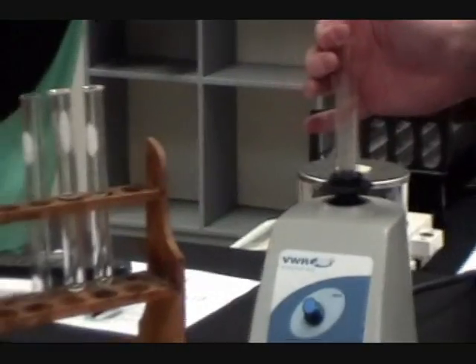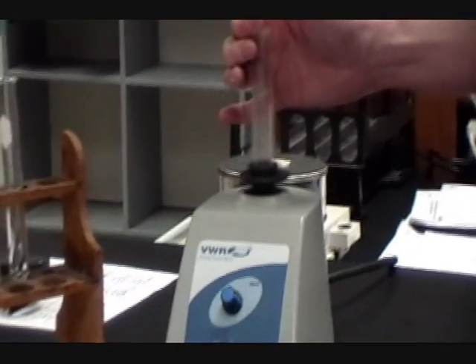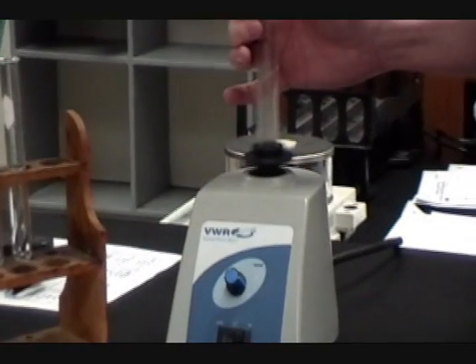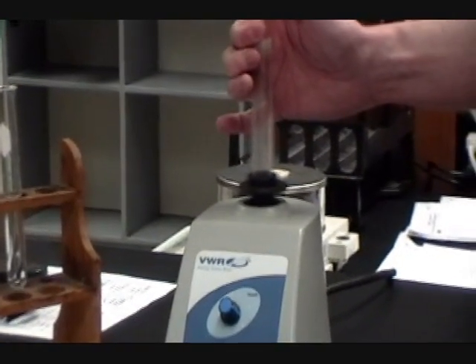Keep doing this until the ammonium chloride will no longer dissolve. Getting that initial crop of ammonium chloride to dissolve does not mean that your solution is saturated. It's not saturated until it can no longer dissolve any more ammonium chloride. So keep those additions going. It's vital, otherwise the last experiment will not work.